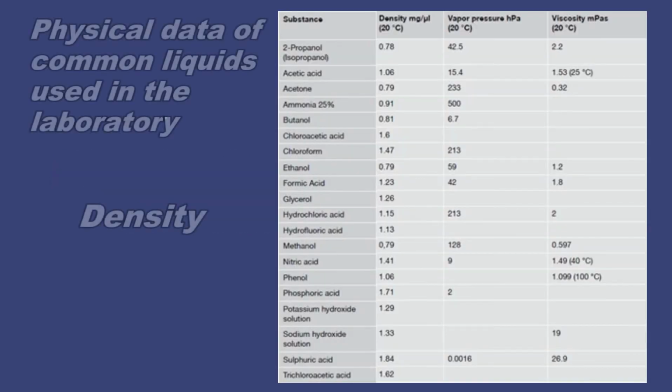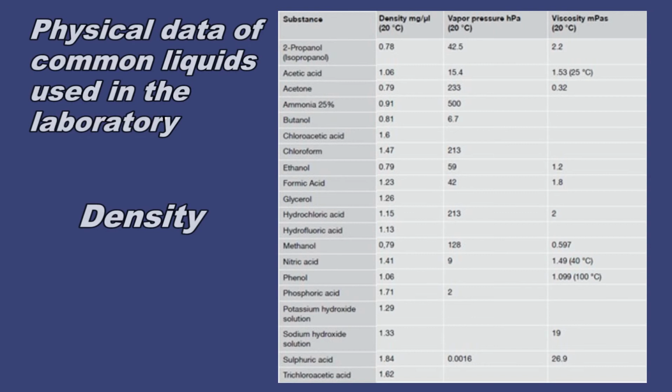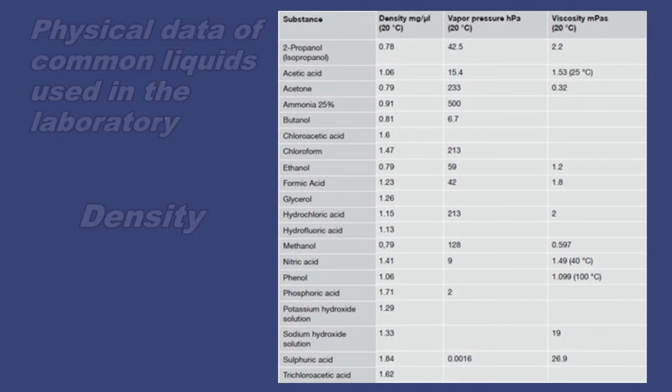Density of the liquid. This means that when pipetting liquids denser than water, the volume of liquid aspirated into the tip is typically less than the set volume. Dispensing systems with positive displacement can be used instead.